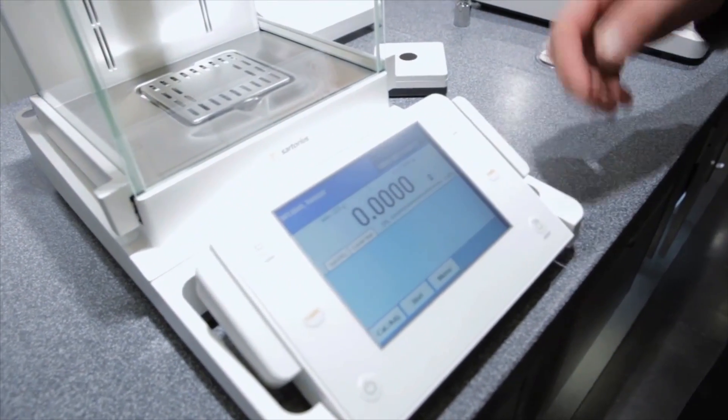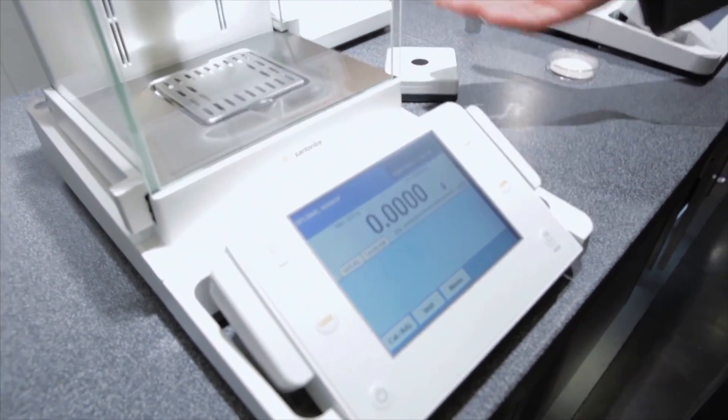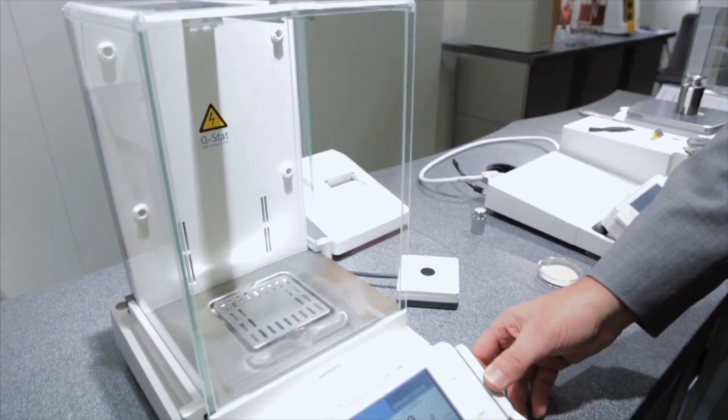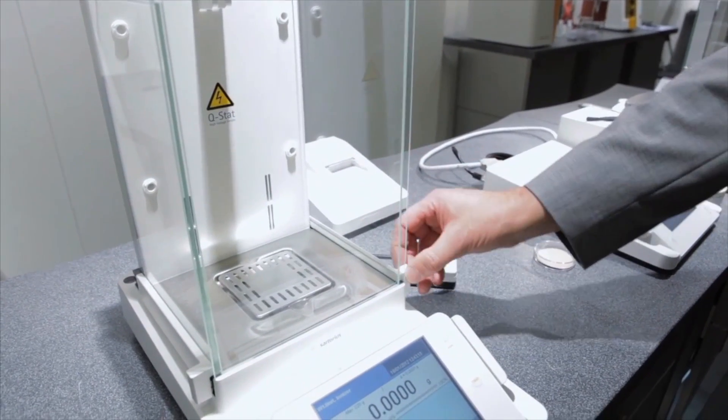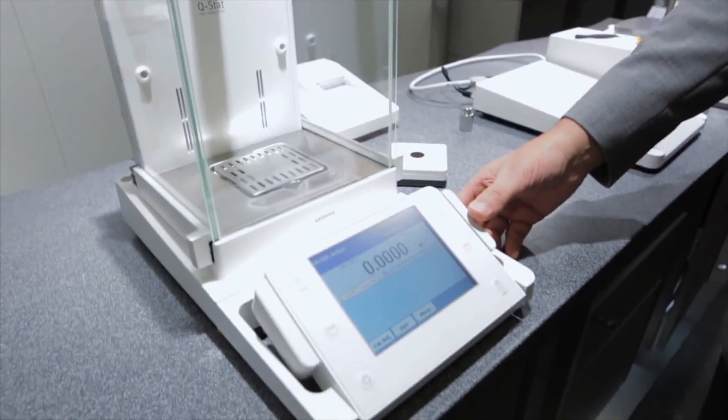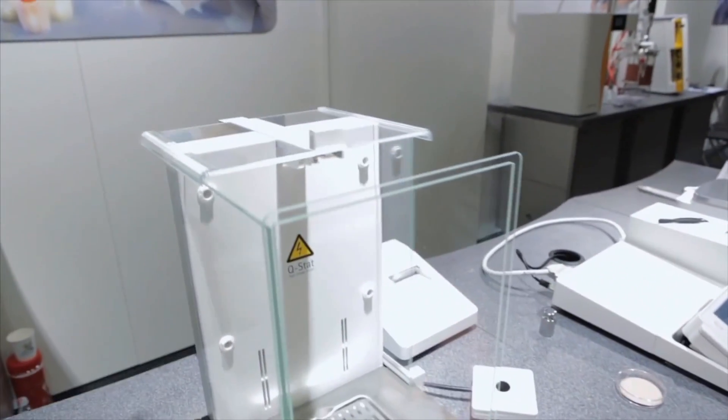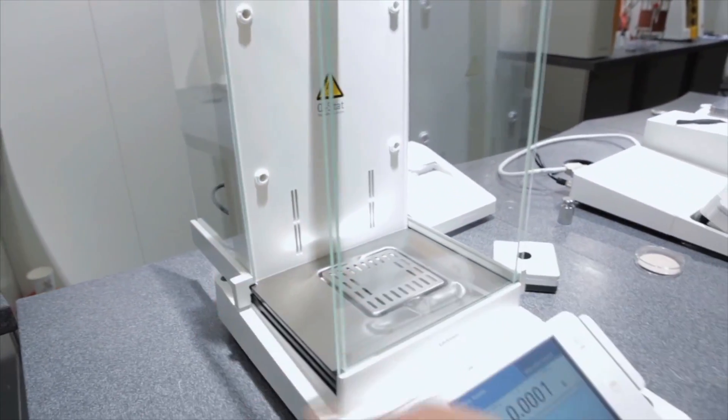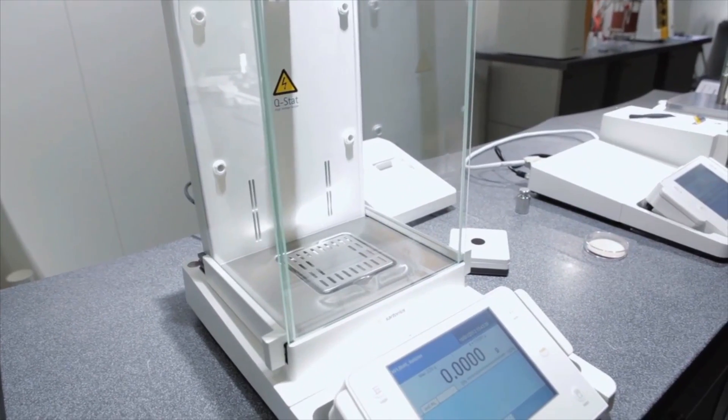This is the analytical four and five decimal place balance and we have automatic draft shield which can be configured by the operator to open either just the side door, the side door and the top, or if preferred, the left hand door only. So the operator is completely in control of exactly how the balance is working.